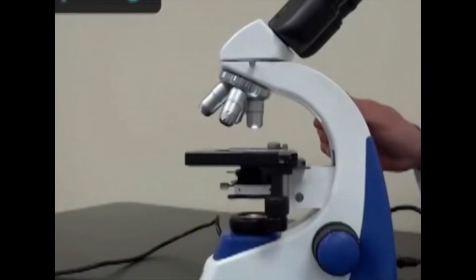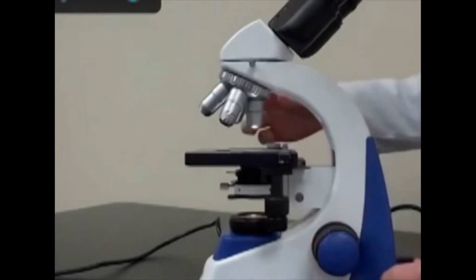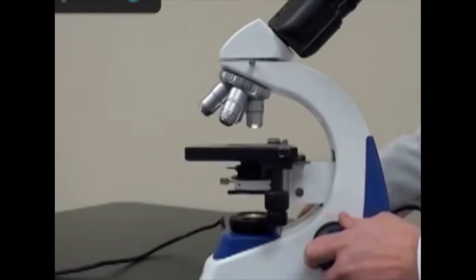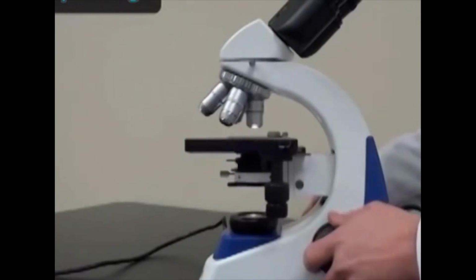The focusing adjustment. The frame of the microscope consists of an arm and a base. In vertical tube microscopes, the arm is normally connected to the base by an inclination joint that allows both tube and stage to be inclined. The focusing adjustment is incorporated in the microscope arm. In straight tube microscopes, a large knob on the upper part of the arm is used for coarse focusing and a smaller one for fine focusing.